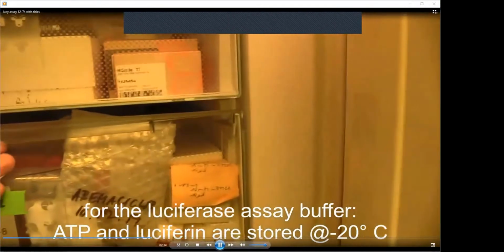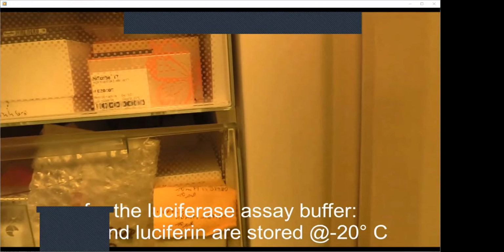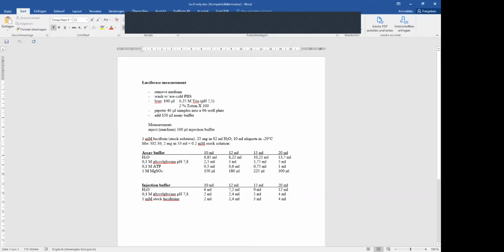Then, for the luciferase assay, you need to prepare solutions. For that purpose, I have also sent you a protocol. I will open it. This is this one. So here you see two buffers. One buffer is the so-called assay buffer, and the other one is the injection buffer.